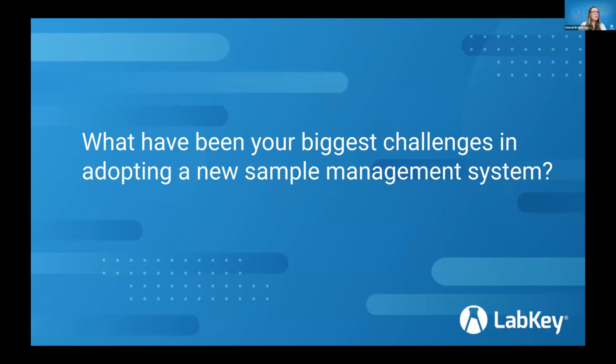Okay, I think we'll end the poll and look at the results here. Again, to remind folks of what these biggest challenges have been. I like to see this because I've done this before. I help people daily with these challenges, and it's great to hear what your perception of this is as well. And so, the lack of tools, the implementation and migration is too intense. 100% agree with you on that.